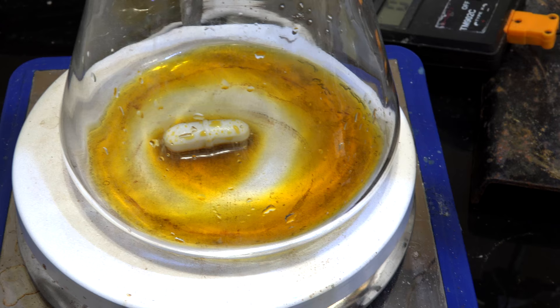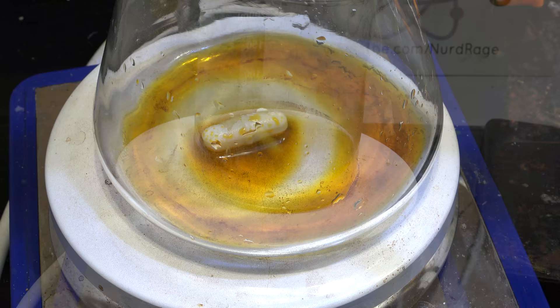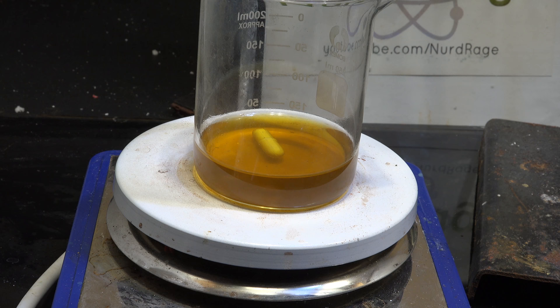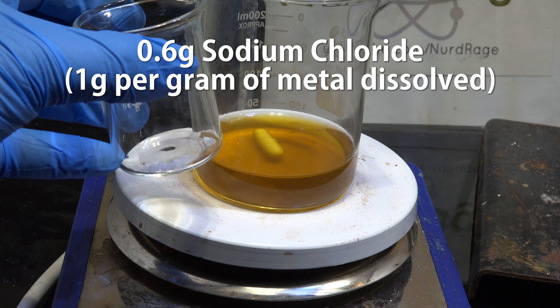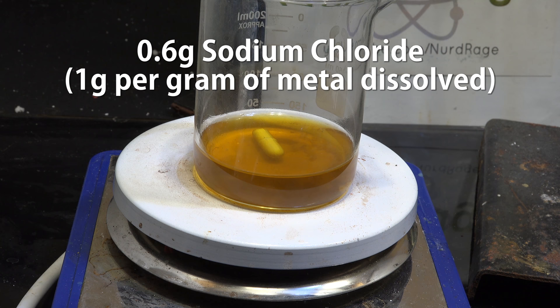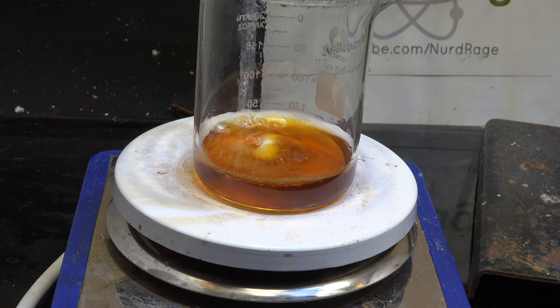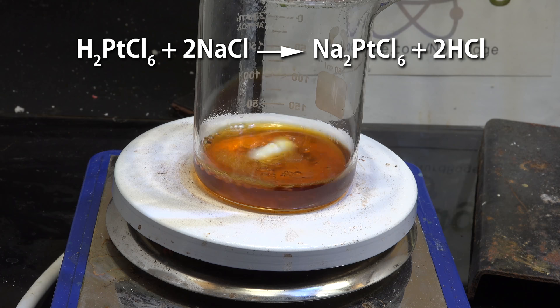Now to remove the base metals by alkaline precipitation. Transfer the solution to a beaker. Mine is a lot more than 10mL now since I've washed out the flask with water. Nonetheless, we can still proceed forward. For every gram of material that was readily dissolved, add an equal amount of sodium chloride salt. Since we dissolved 0.6g of metal, we add in 0.6g of sodium chloride. Now gently boil down until dry. Don't use too high a heat or you'll decompose the platinum salts. I set my hot plate to a temperature of 120 celsius.